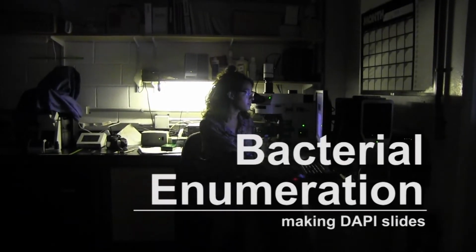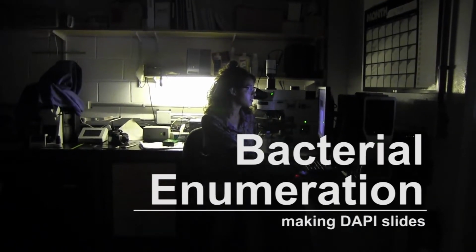This is for bacterial enumeration, and we use a stain called DAPI, so we typically call it making DAPI slides. It's a way of quantifying the bacteria in the seawater.